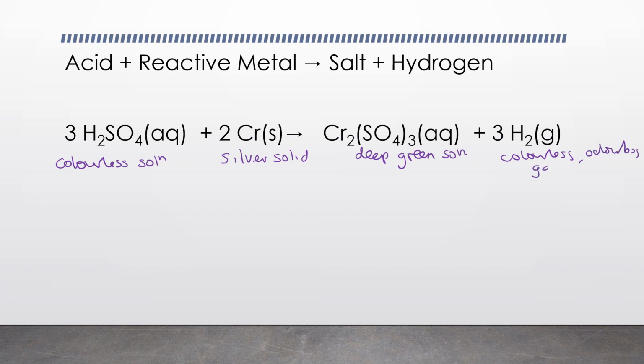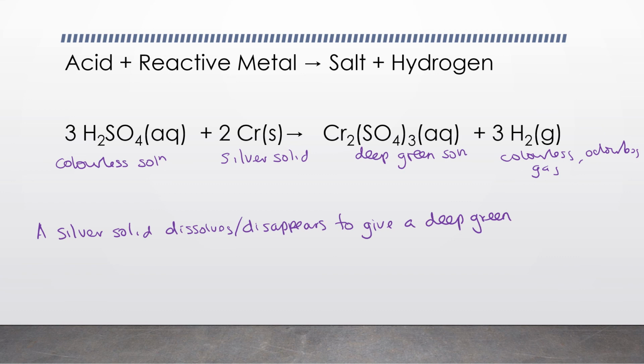So our observation would be a silver solid dissolves or disappears to give a deep green solution.